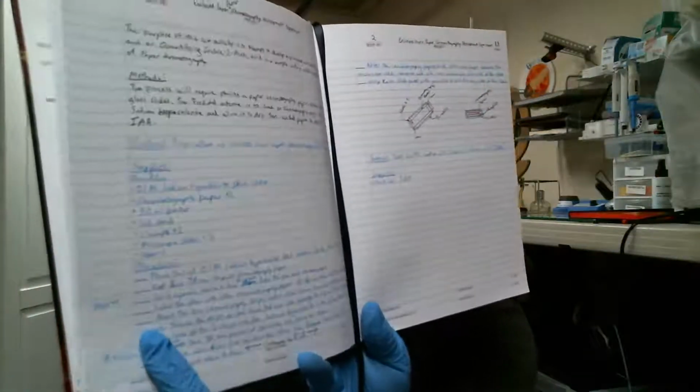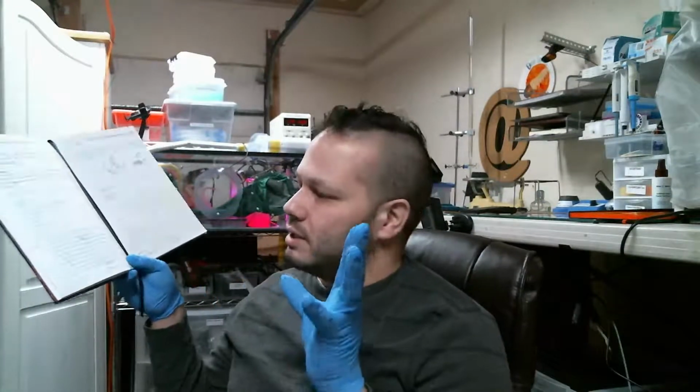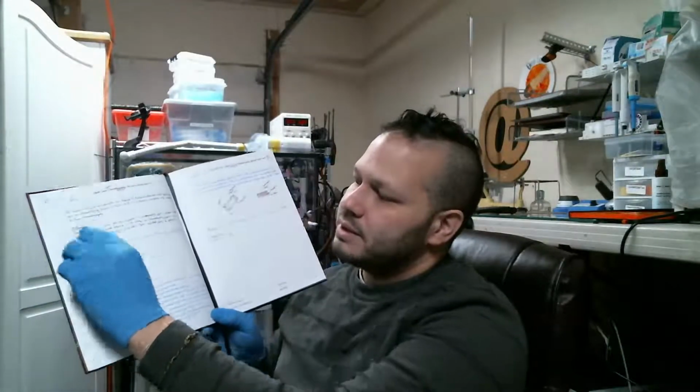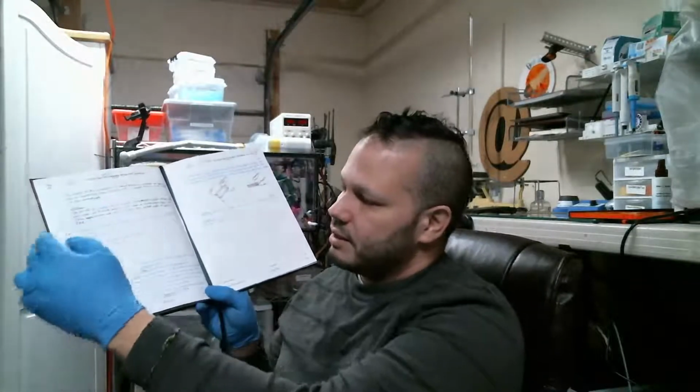And any results I write down. But essentially, I go through and I make a little checklist. Let's see if you can see that right there. I make a little checklist that I can check off as I go through. I've come up with a nice structure at this point where first, as I said before, I do the purpose, a brief description of the methods, and then I write down the protocol.